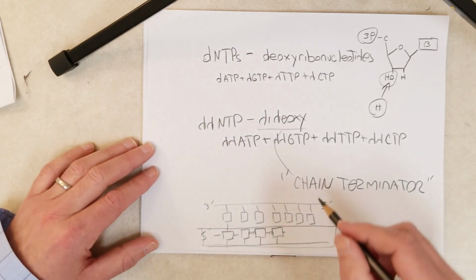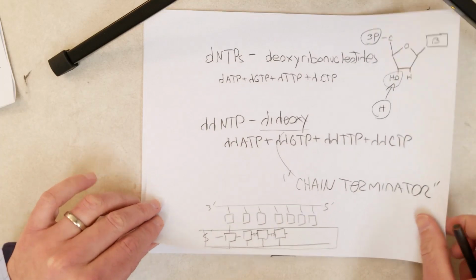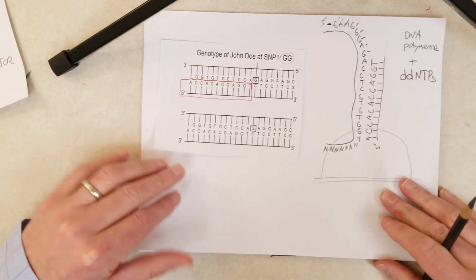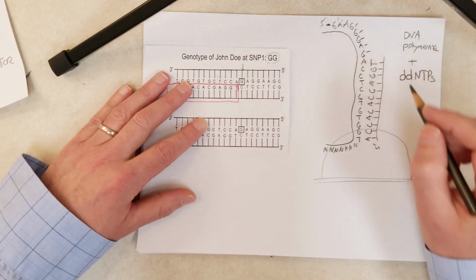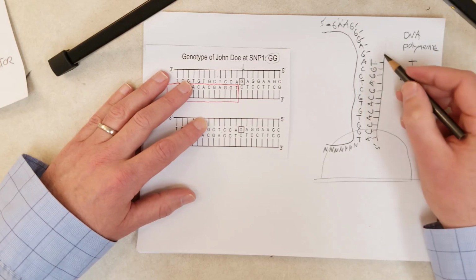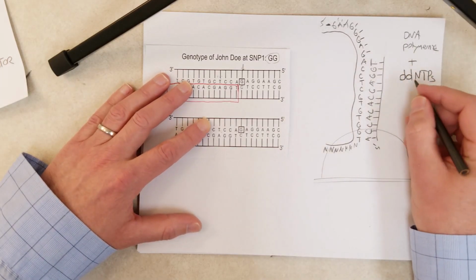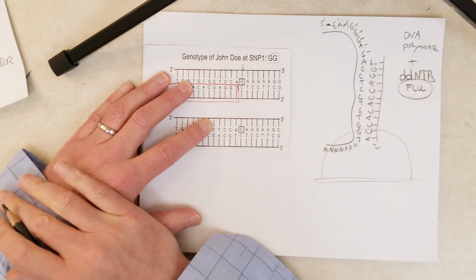Okay, so by adding ddNTPs, the DNA polymerase can at most extend this by 1 nucleotide. It can only add 1 nucleotide to the SDO. And so I should also say that ddNTPs are fluorescent.